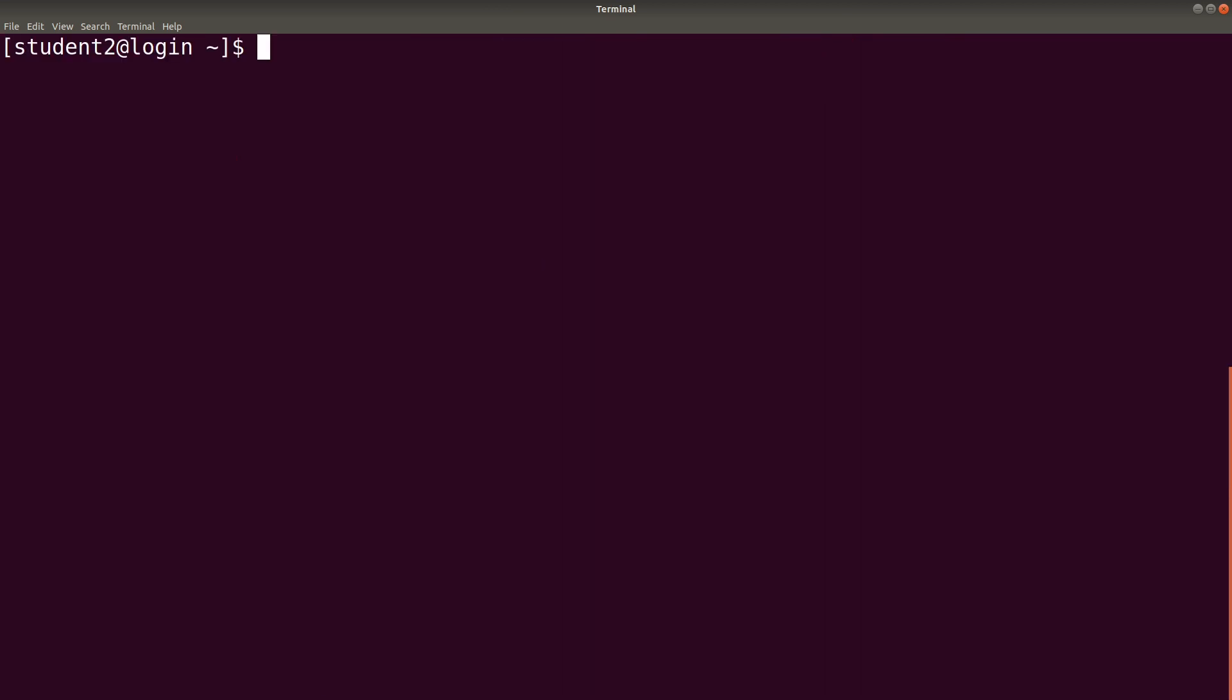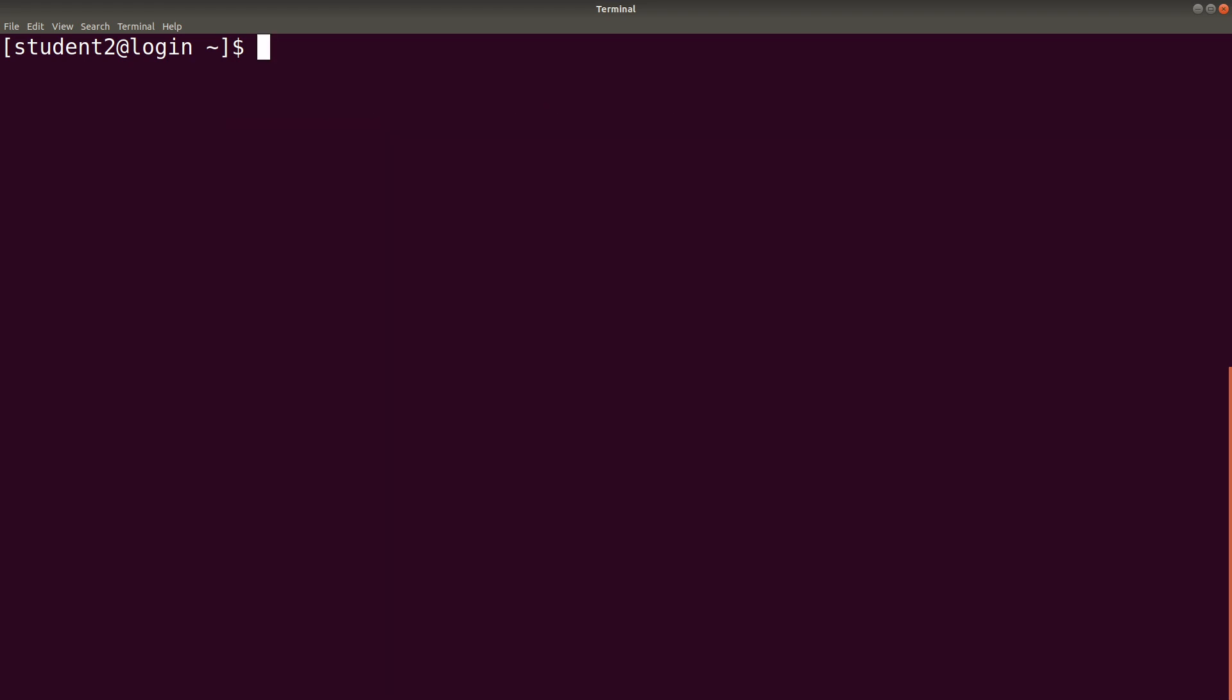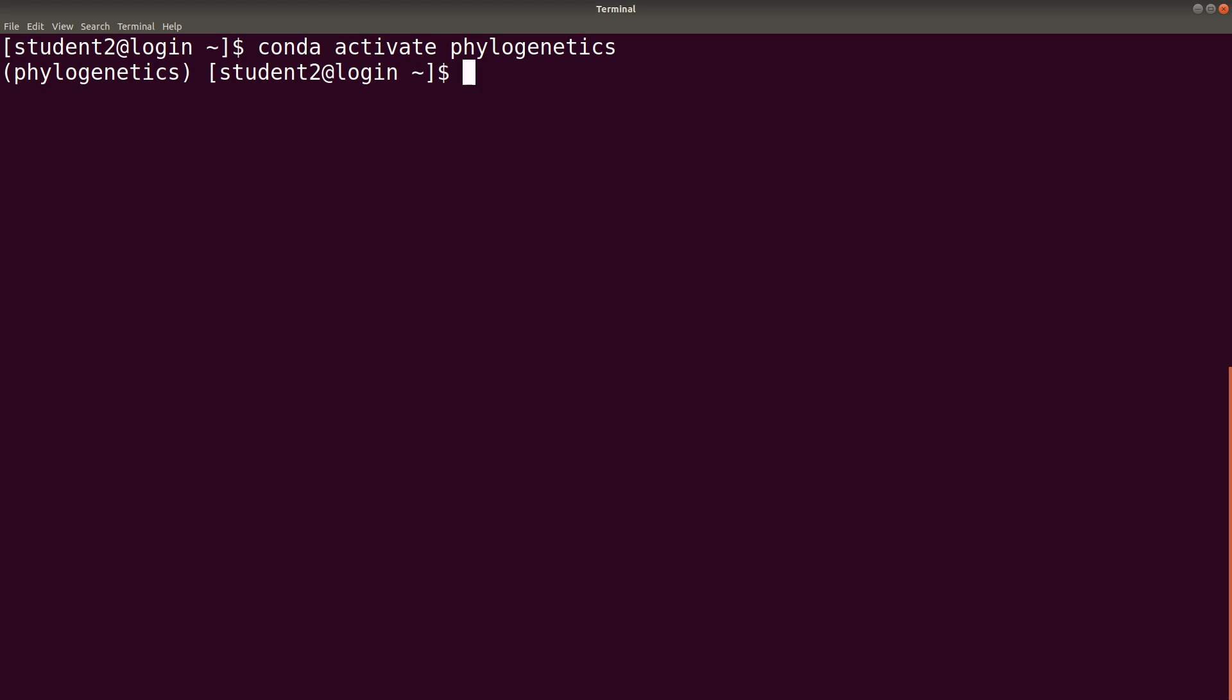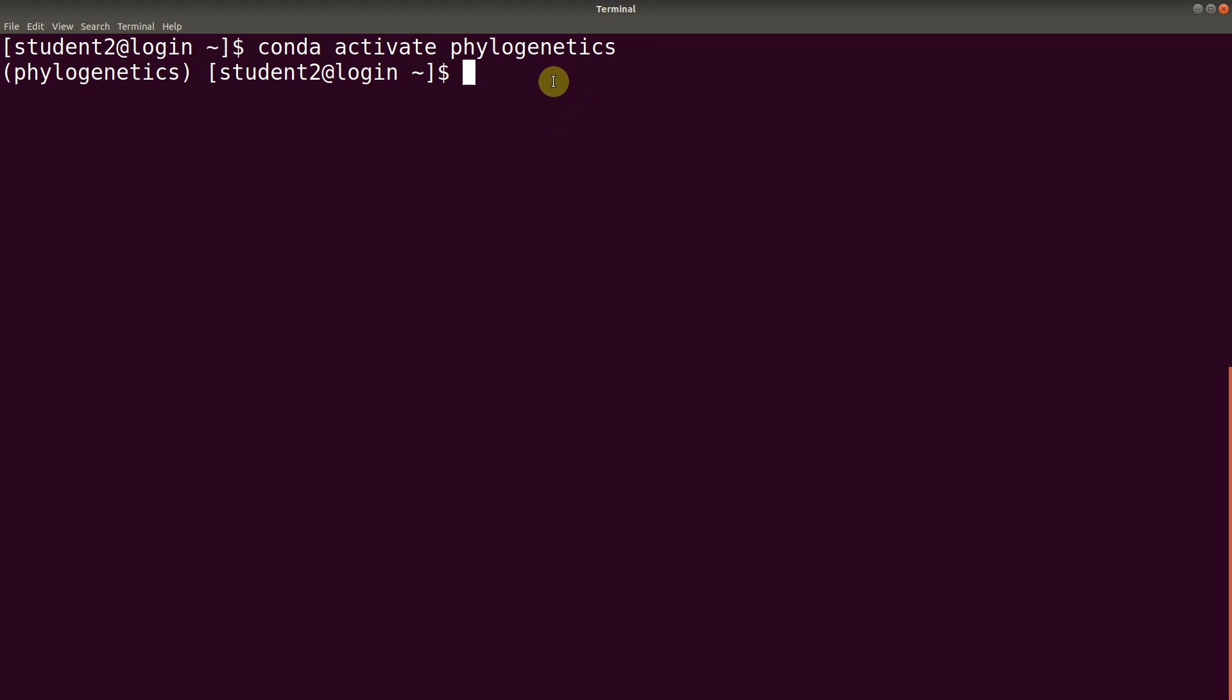Let's clear the screen first. In order to run RAxML or test it, we need to first activate the environment. So, let's do it. We say conda activate phylogenetics. Once it's activated, you will find its name appearing on the command line as well. Now, we can test RAxML.